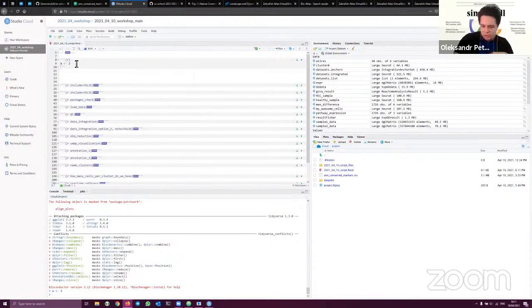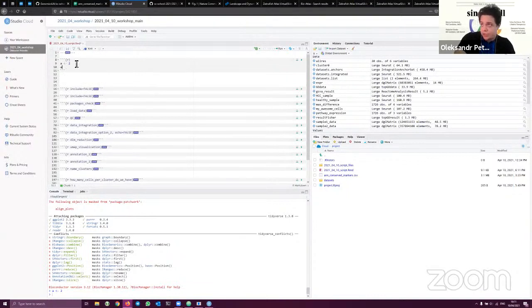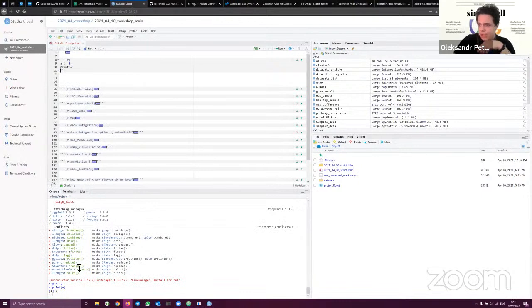And now, if I just use another line and do something like this, print a, the output on the console will be 2, which makes sense because we just assigned it to 2. Okay.